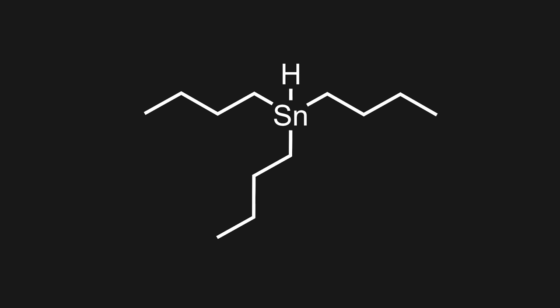In this video I will be turning tin metal into tributyl tin hydride. Tributyl tin hydride is a useful source of hydrogen atoms in organic synthesis and I will be needing it in the future.